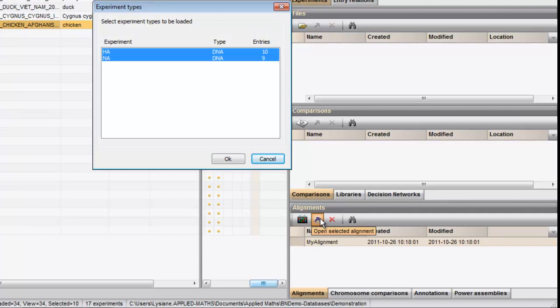Select the sequence type you want to work with. If more than one experiment is available, they may be selected together. Press OK.